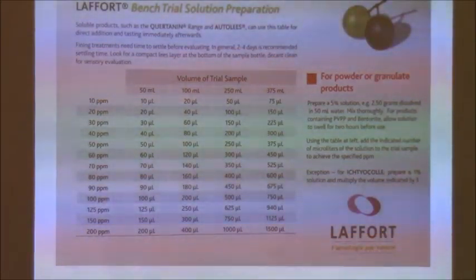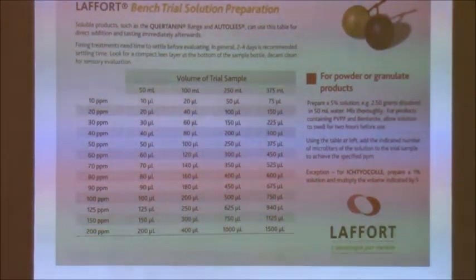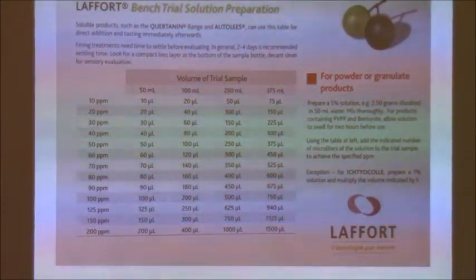One side says for liquids and the other says for granulates. So granulate would be a powdered product. So any of the tannins and autolyse, those come in a powder. So you make a 5% solution of that, which would be adding 2.5 grams dissolved in 50 mils of water. Or you could do 1 gram in 20 mils of water.